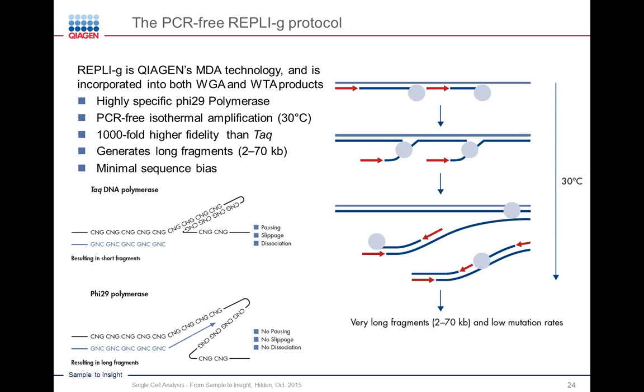I think it's 10 to the 5th. But it's also, depending on which enzyme you're using, somewhere between 10 and 50 times better as far as not introducing indels and SNPs, or point mutations, than a lot of the high-performance thermostable polymerases that are out there.